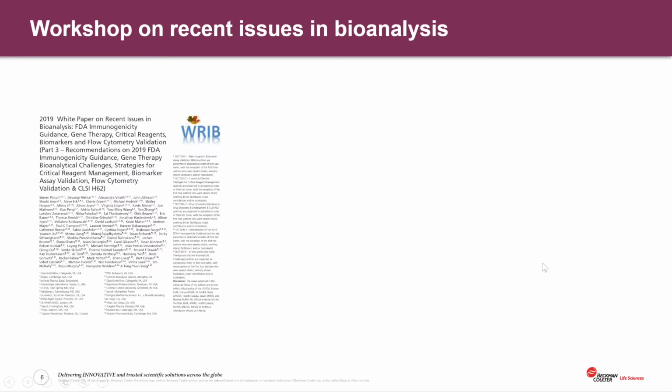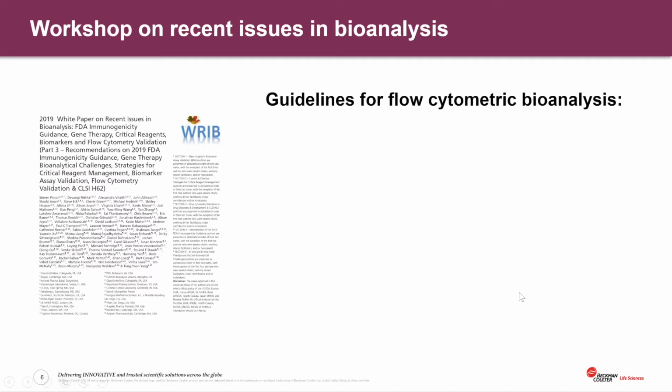So the actual issues of irreproducibility have been addressed in a workshop that has occurred for the last 5 years. Specifically, this workshop looks at recent issues in bioanalysis. This is where the global leading biopharma, biotech companies, as well as CROs and regulatory agencies get together and meet for a span of 7 days and look at all the issues in bioanalysis. Last year, 2019, they came up with guidelines specifically for flow cytometry bioanalysis.